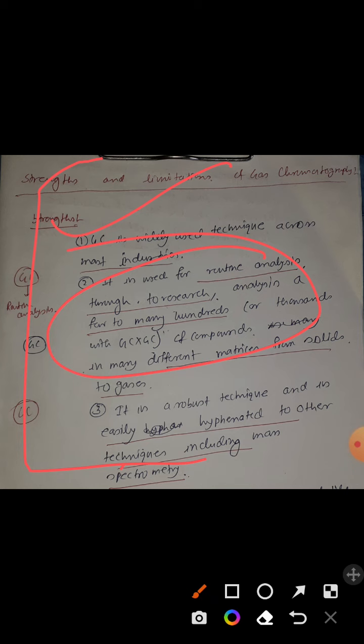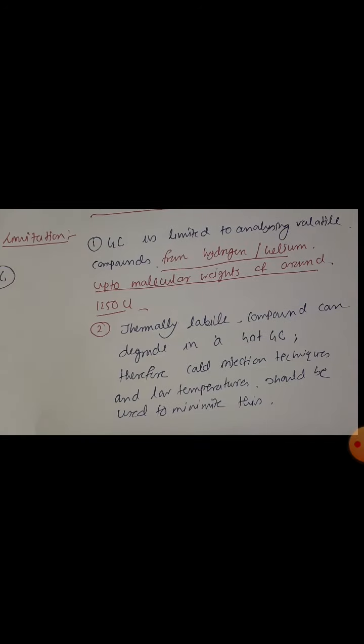That means you only have to remember that it is used for routine analysis and in research purposes. Here we can analyze a few to hundreds of compounds in different matrices, such as solid to gases. It is also a robust technique, and it can be easily hyphenated to other techniques, including mass spectrometry.